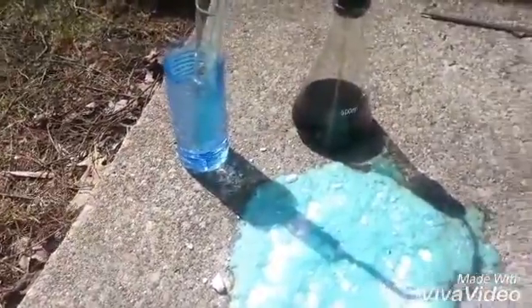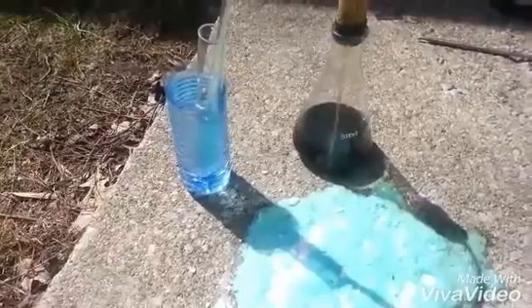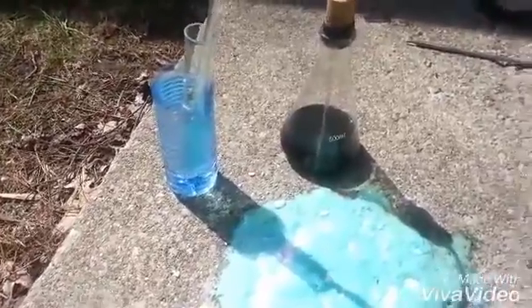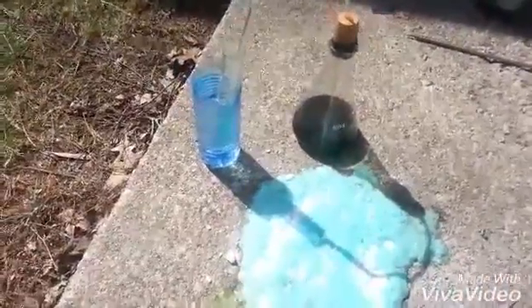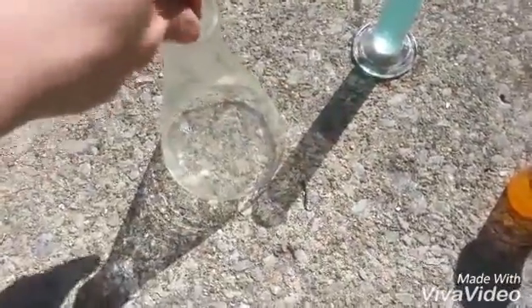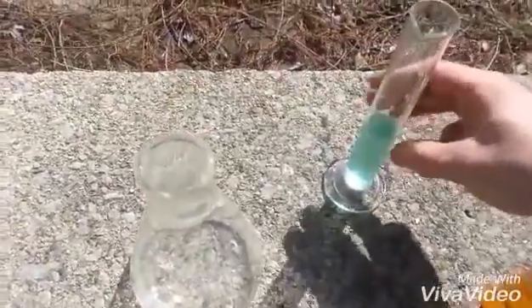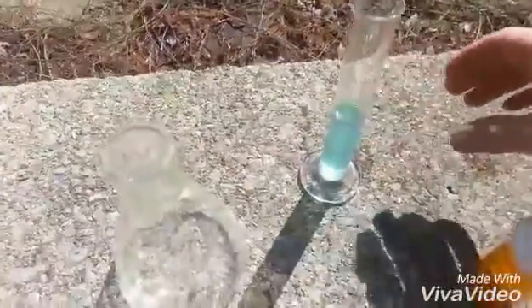So the reaction is completely stopped, and I'm going to go ahead and pull off the cork here in a minute and get my acid. So here is my gold bearing copper nugget in the clean flask. And you can see some hydrochloric acid did get into it, not much.